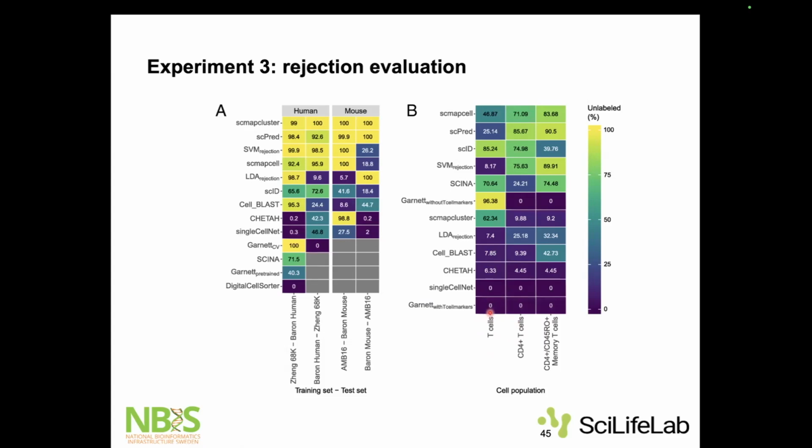They are not rejecting them, because T cells, of course, overlap and are similar to another cell type probably in the data set, so they are getting that label instead. And that also varies in each data set and each method, because they are using different thresholds and making different decisions inside these classifiers about when and where to reject a cell.